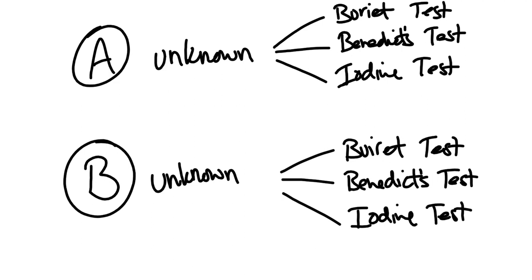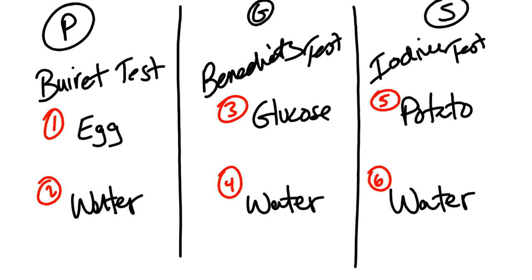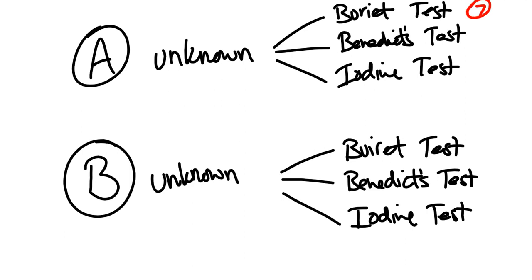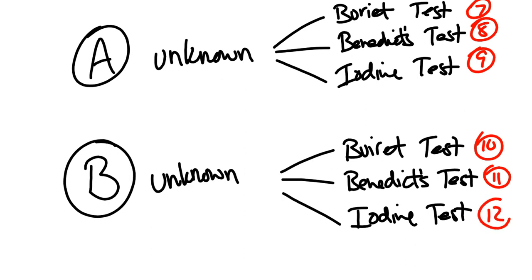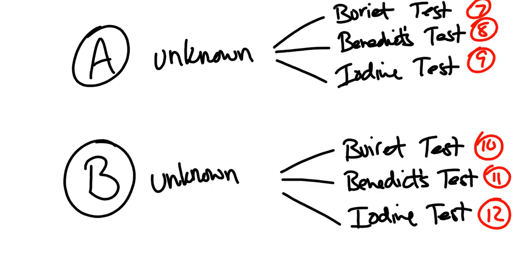All right? So, grand total, you're going to be doing 12 total tests in this experiment. Okay? 6 of them are to determine what your positive and negative controls look like, and 6 are going to be to identify any biomolecules present in your unknown.